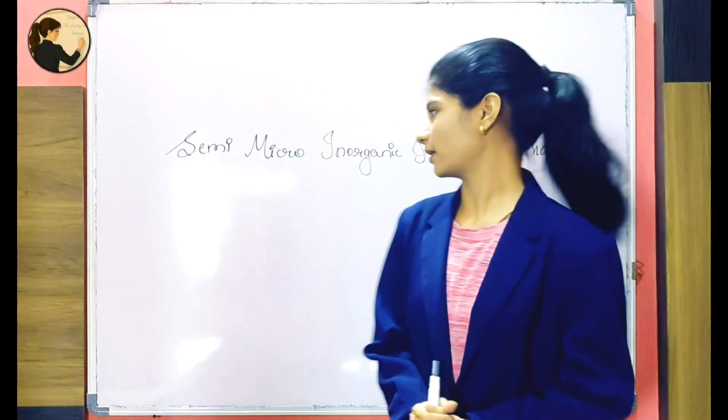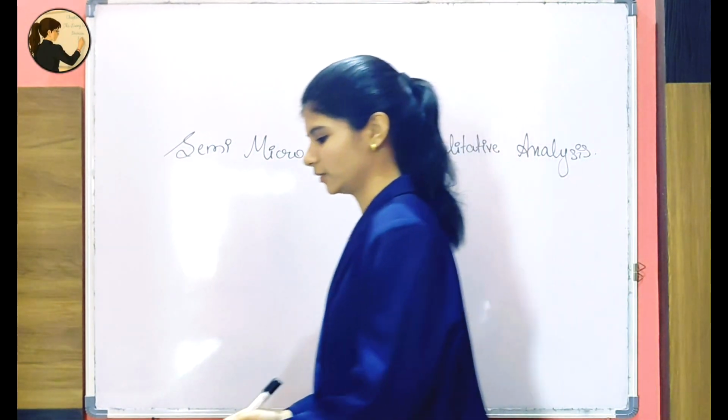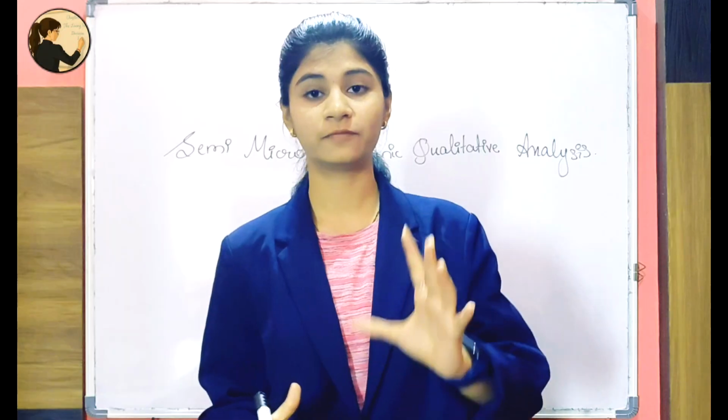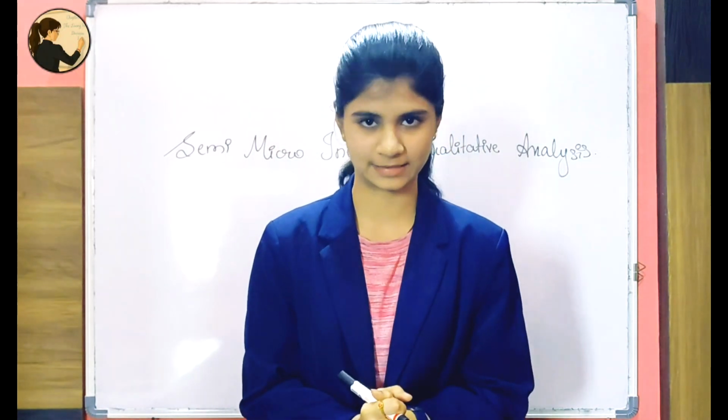Yeah, so we'll be starting with semi-micro inorganic qualitative analysis. There are 12 to 14 salts in your syllabus, of which you will get only one salt in your exam, that is, in the practical exam.